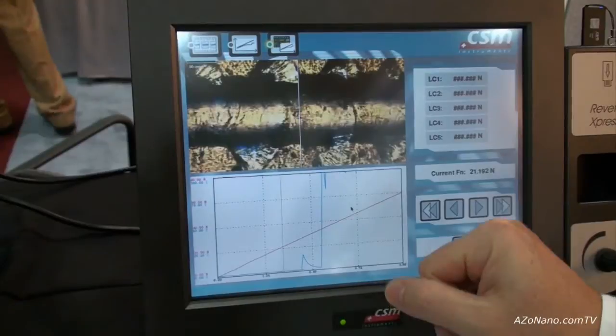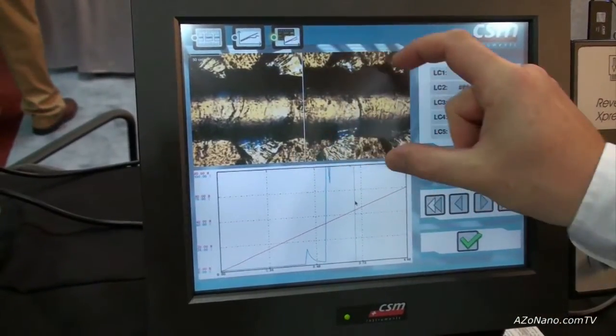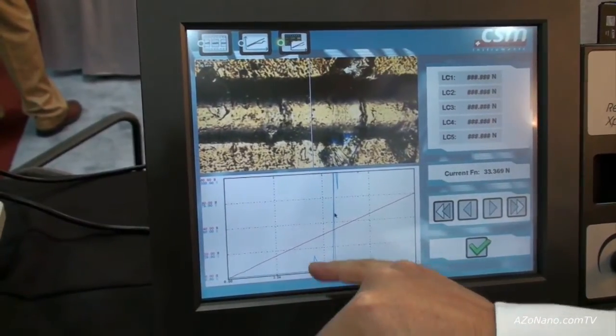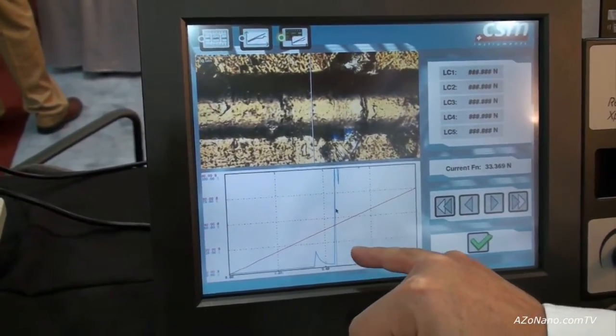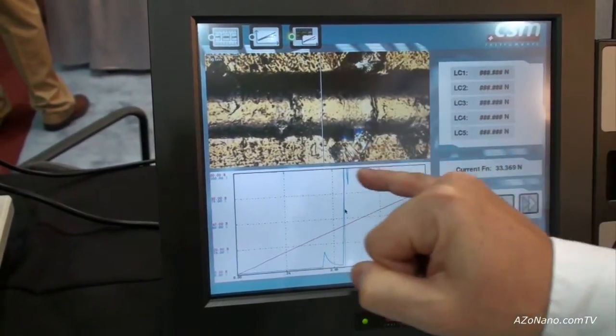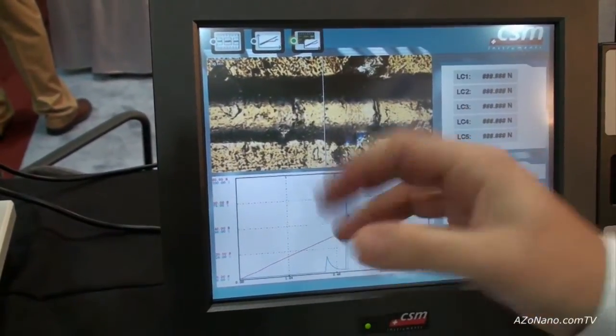So I can actually search along here and look for failure. Here we can see spallation along the side of the scratch and what's interesting is we see that the onset of acoustic emission signal correlates with some deformations on the side of the scratch stripe where we start to fail the coating.